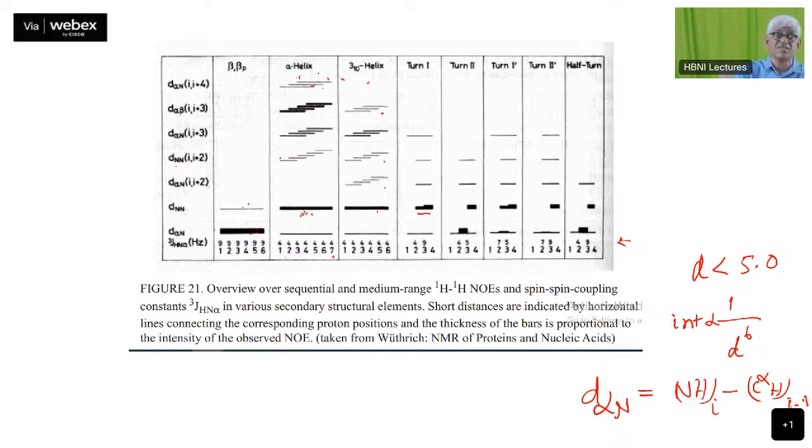One has to be aware of this, because when you analyze the noisy spectra, there will be thousands of peaks. These alone will not account for all of those. There will be many others left, and those will correspond to these small intensity peaks. So turn 1 and turn 2, both of them have these kinds of features.